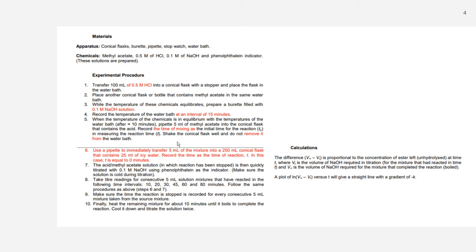So you just follow the same procedure as you will see in that video, okay? And every time you take another set, you wash whatever the first iteration was, then you wait until the 20th minute and start again, pipette out the 5 ml of the mixture, and make sure that you add ice first, and the phenolphthalein, and then the mixture, and then you titrate.